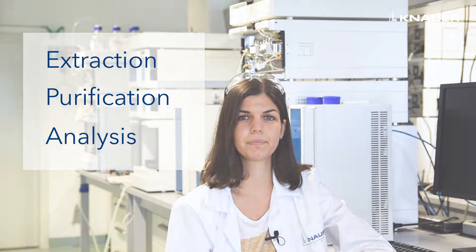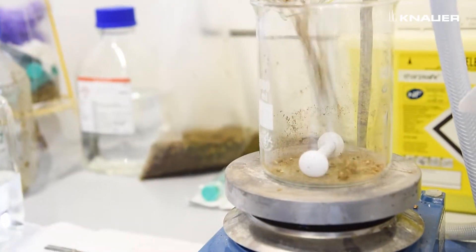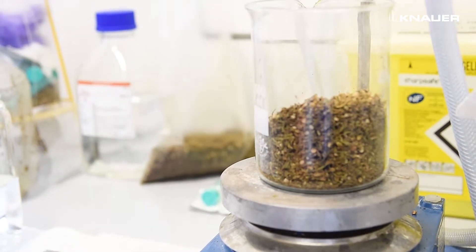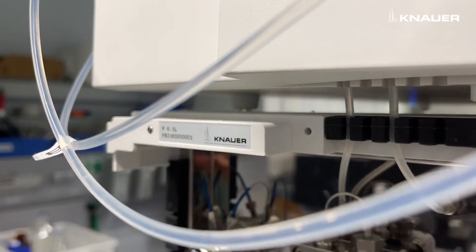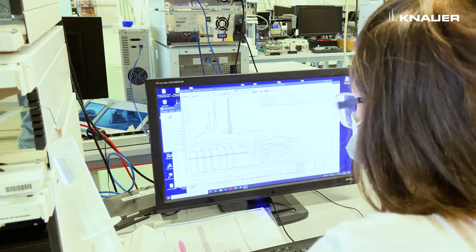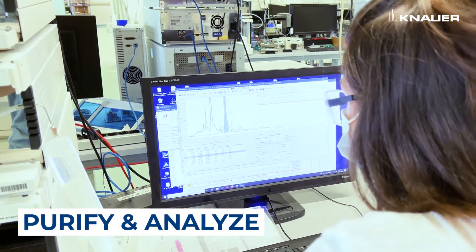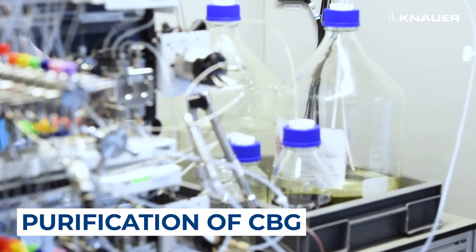In this video I will show you all the steps necessary for the extraction, purification and analysis of CBG. In Canaver they are experts not only in the analysis but also in the purification, especially of cannabinoids. The aim of this project is to purify CBG from dried hemp material through simulated moving bed technology.